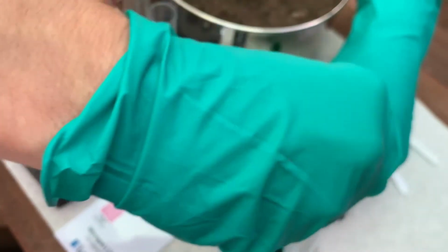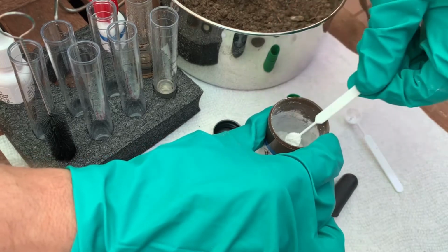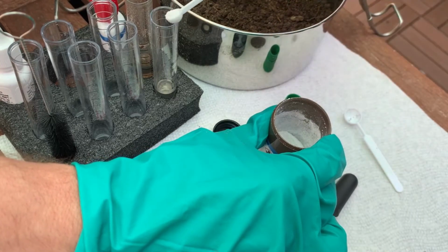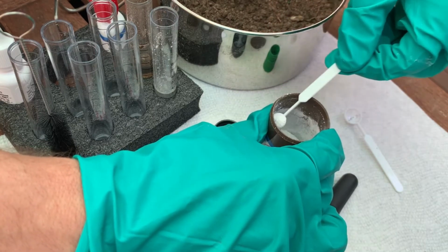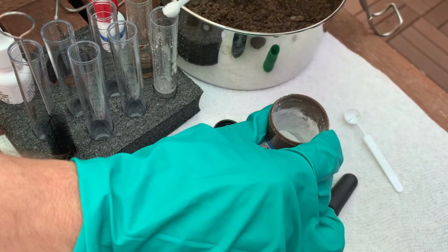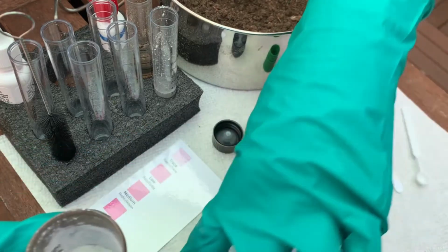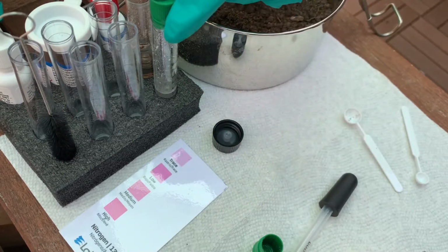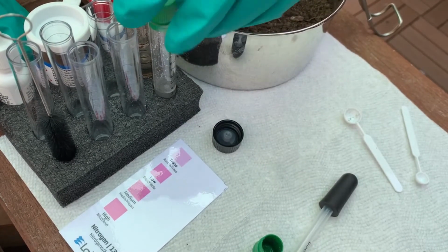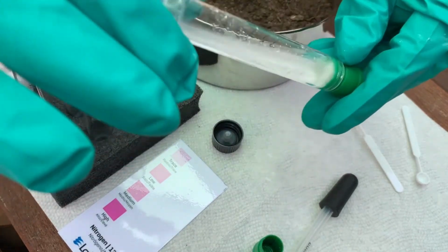And then next we use the small spoon, the 0.25 gram spoon. We're going to add 2 measures of the nitrogen indicator powder to our soil extract in the second tube. And then make sure you put the cap back on. Now we'll put a cap on the second tube. And gently mix.